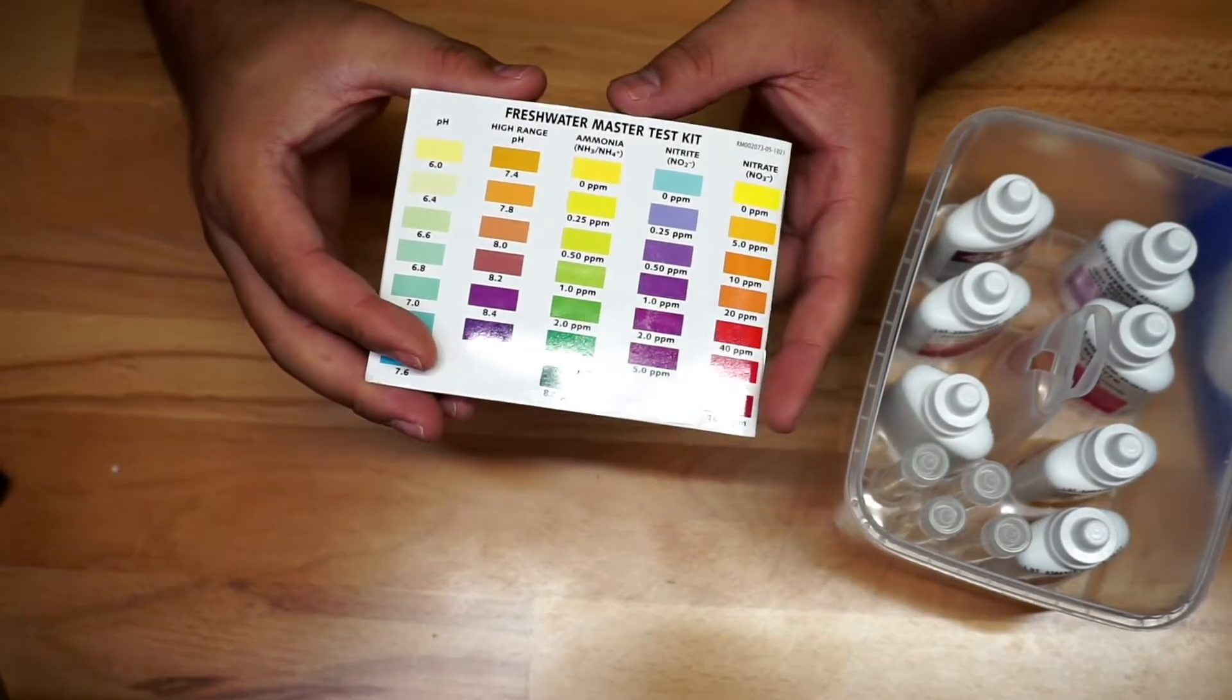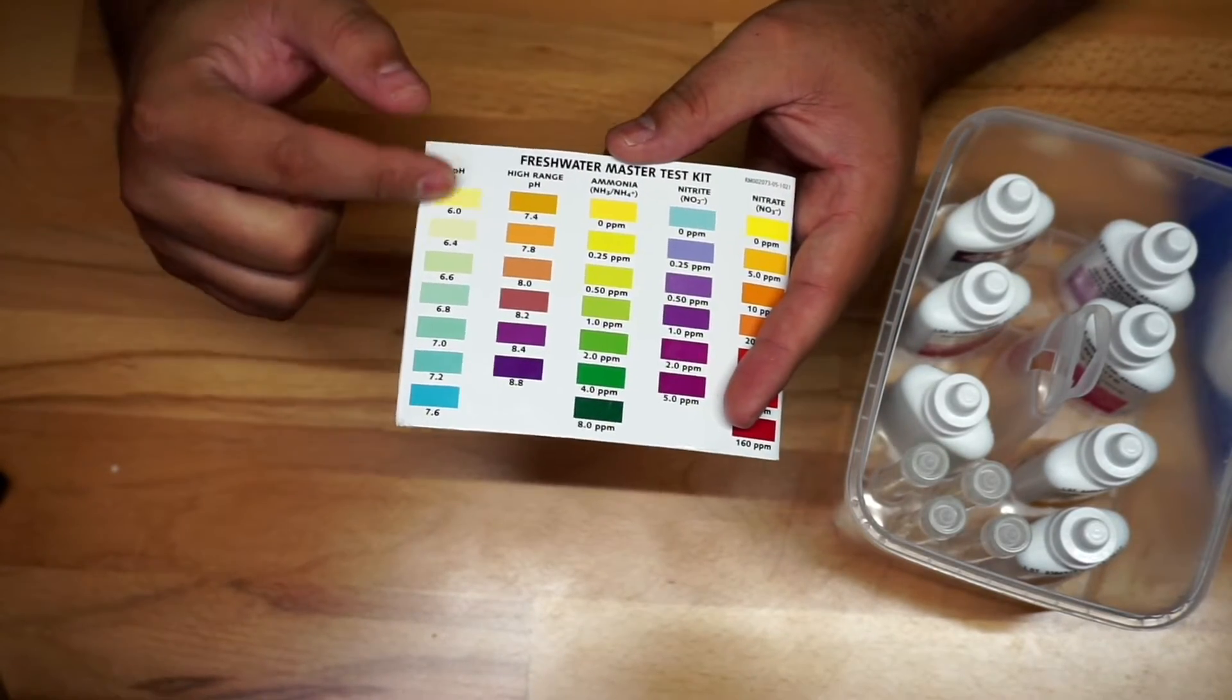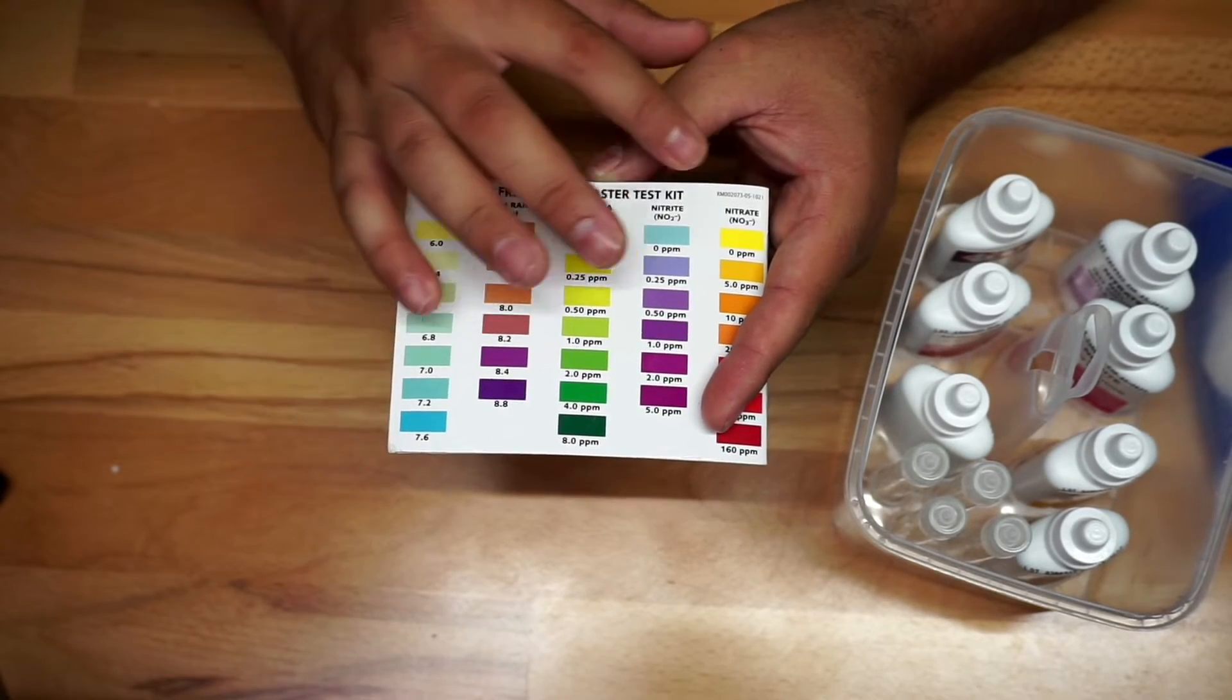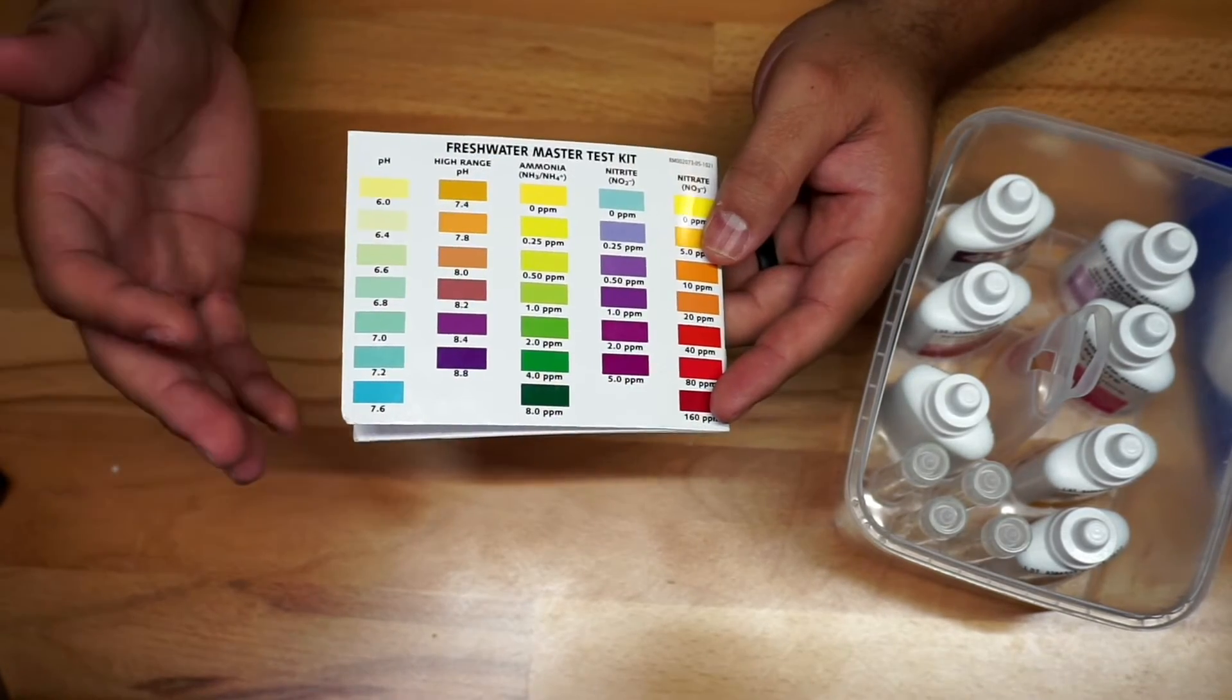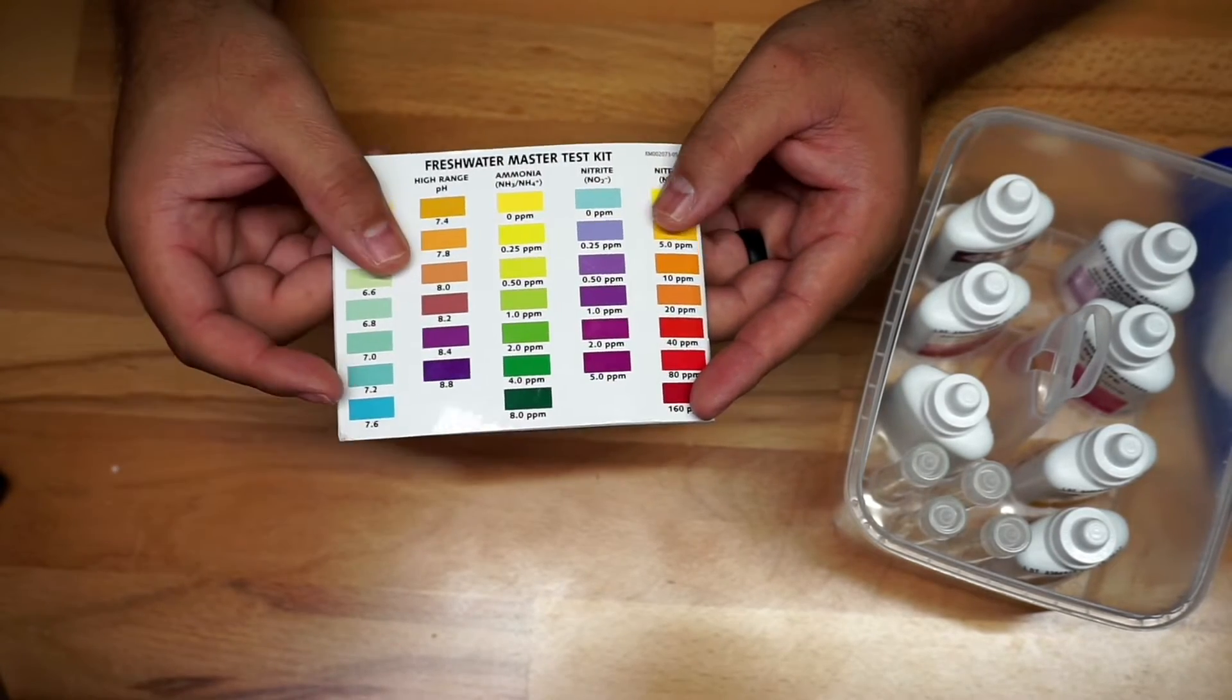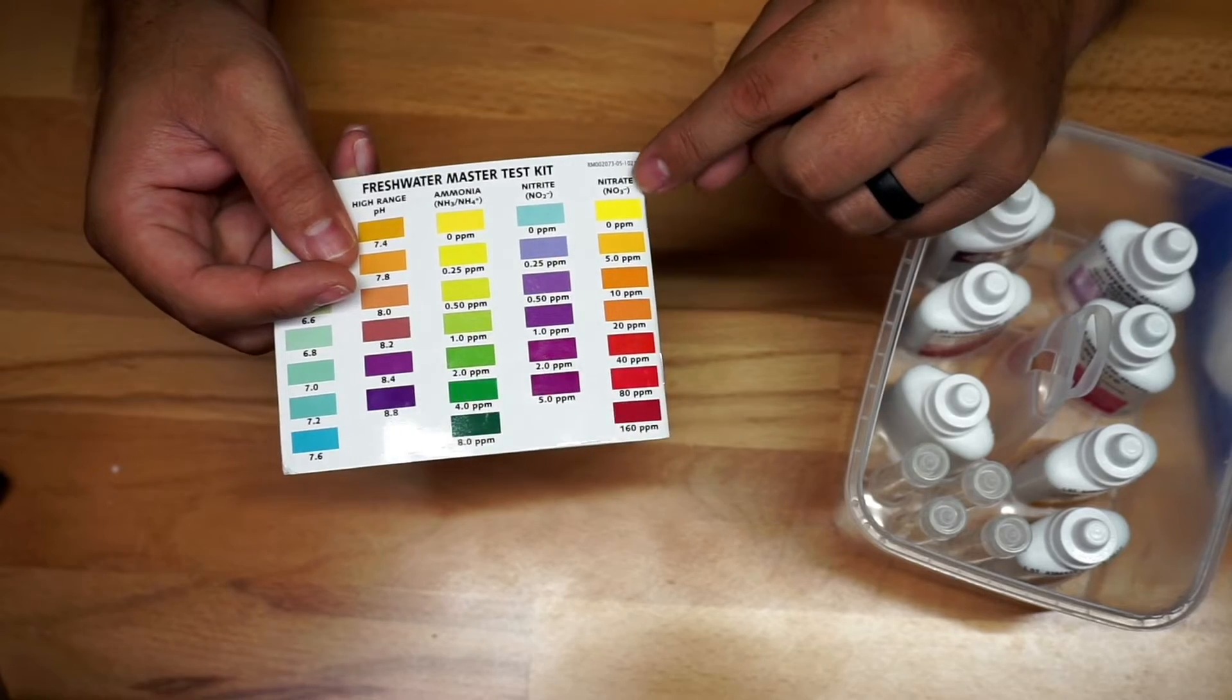Everything is going to be here in instructions and then you can see the color chart right here. You could see the pH, you could see the ammonia and the nitrates. It's going to give you an idea if you have an ammonia spike, your fish could potentially die depending on how much nitrate you have in your fish tank.